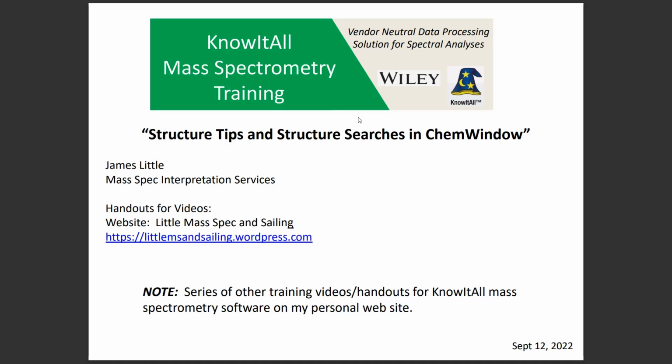Wiley has introduced new mass spec capabilities in their KnowItAll software. KnowItAll is a vendor-neutral data processing solution for spectral analyses. I have created a series of training videos for the software which can be found on my personal website. Today I will be sharing a presentation entitled Structure Tips and Structure Searches in ChemWindow.